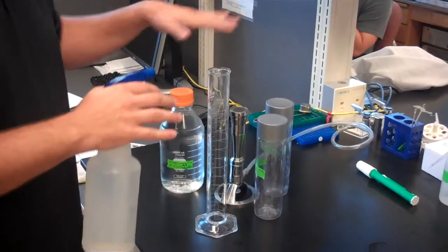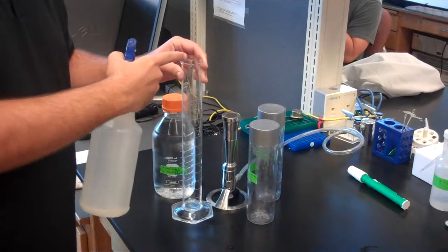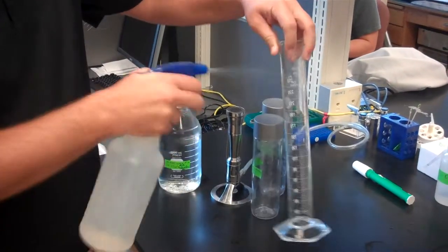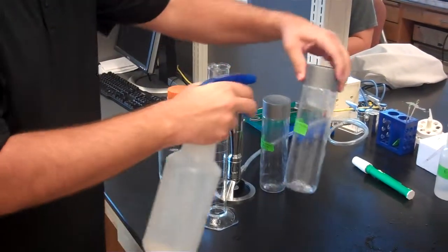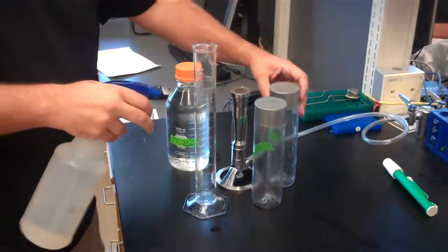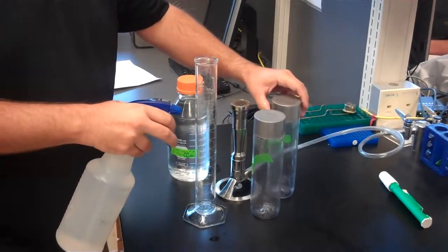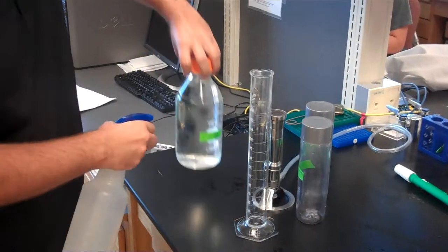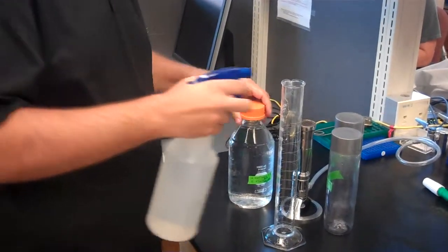So what I'm going to do is take all my materials and spray them down with ethanol. This doesn't have ethanol. Normally this would have a piece of saran wrap or tinfoil over the top of it after it was sterilized, so when you're moving it into the sterile field it was sterile. Put that in there. Notice I'm doing this before I turn the burner on because ethanol is flammable. So I do not want to light the burner and then spray ethanol because that would be very, very dangerous.